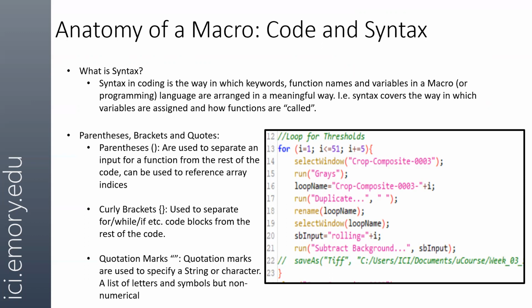You might have noticed at this point that all the words, even the numbers, are different colors. That is a pretty common thing in programming, where different parts of the language show up in different colors.